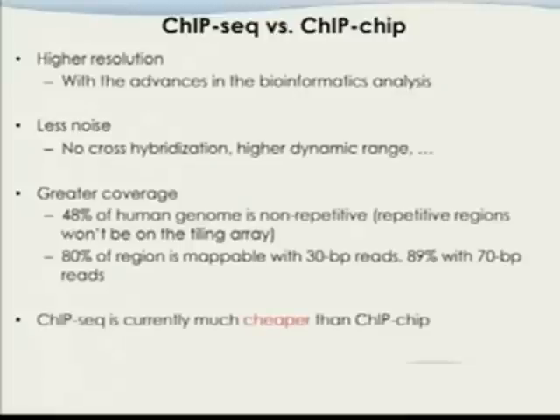We'll think about that. And the next point is simple. It's cheaper. So that's one of the major advantages. Actually, it's a lot cheaper, ChIP-seq compared to ChIP-chip at the current stage.